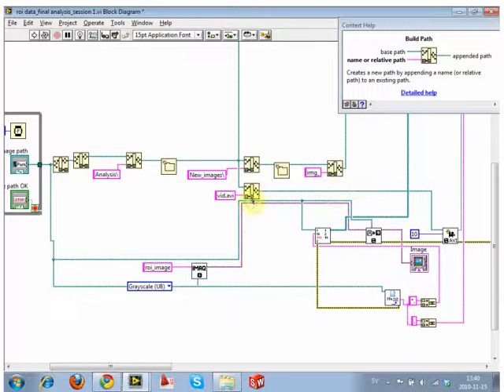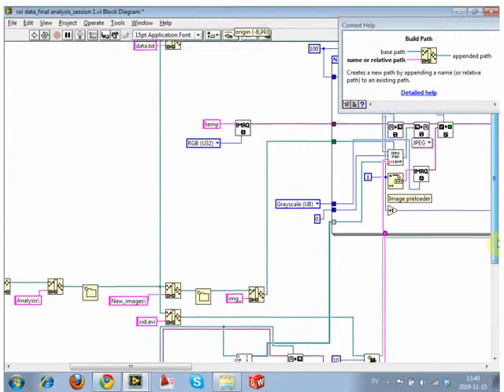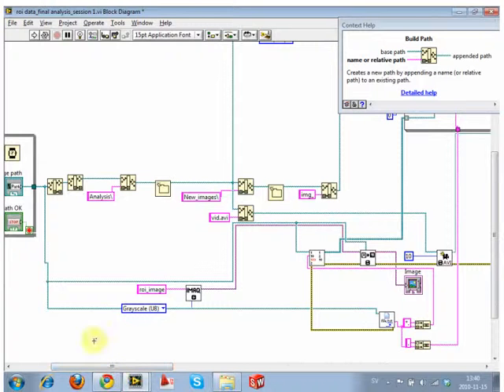We're also making a video, so we need to come up with a video file name and put that somewhere too. So we're doing quite a bit here. What we're going to do is destroy it all and then rebuild it. Let's be really harsh, and then you can see how we fumble along to make it right.